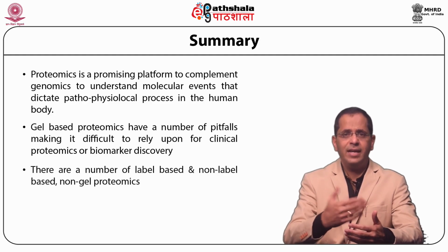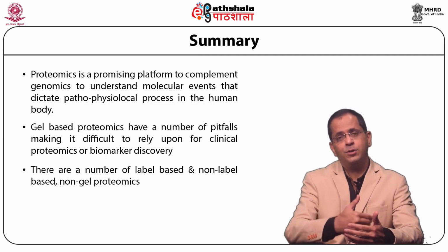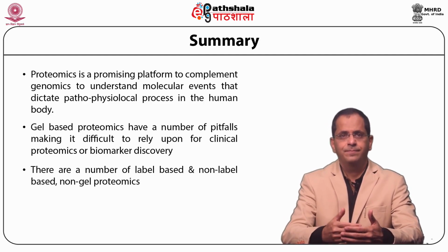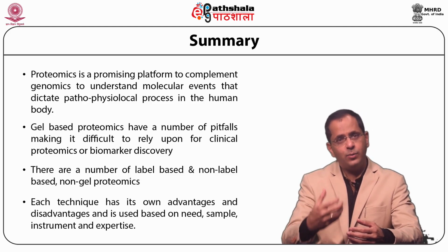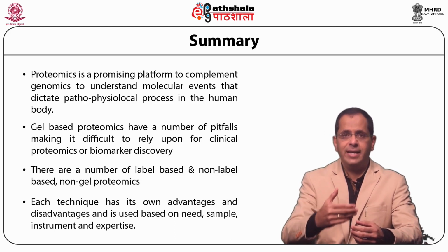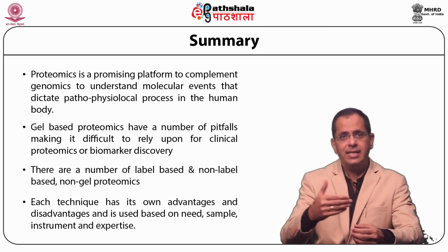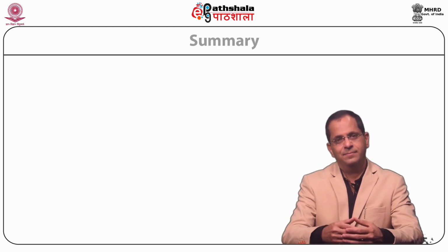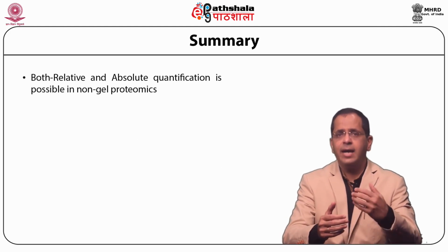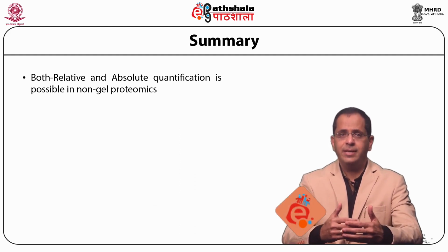There are a number of label-based and non-label-based non-gel proteomics approaches. Each technique has its own advantages and disadvantages and is used based on the need, the sample size, the instrument, and the expertise available. Both relative and absolute quantification is possible using non-gel based proteomics.